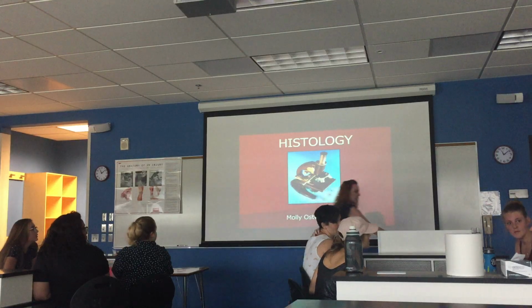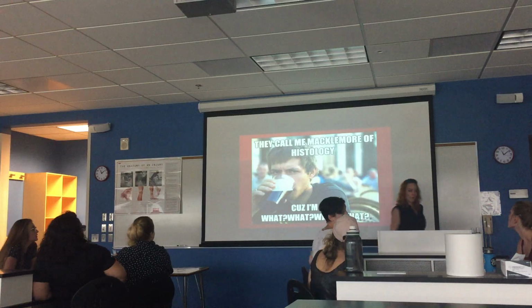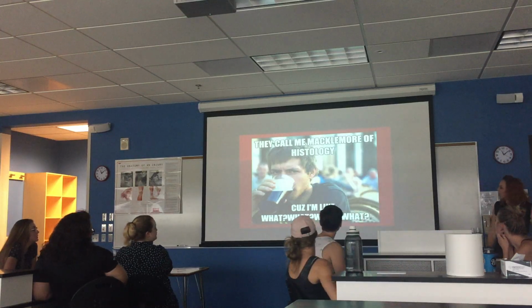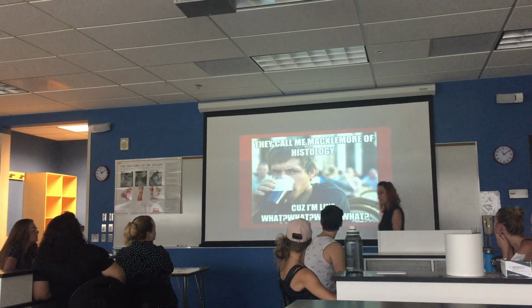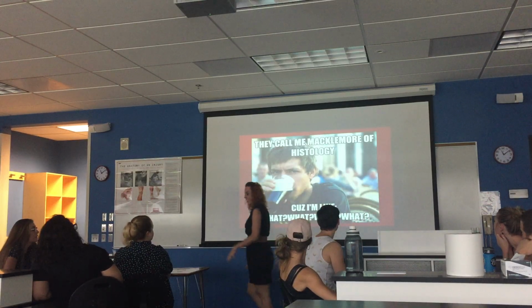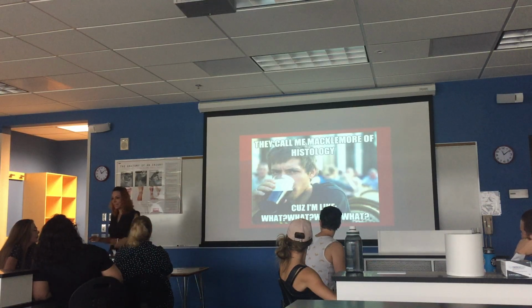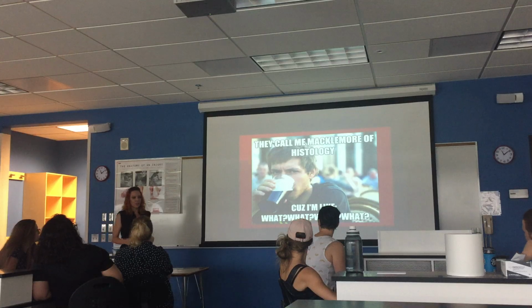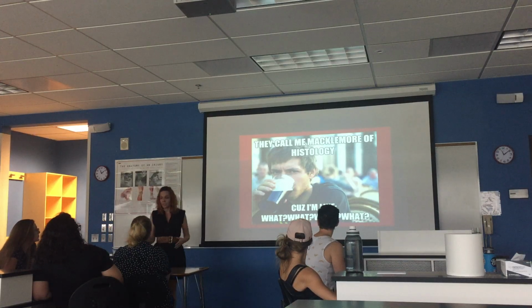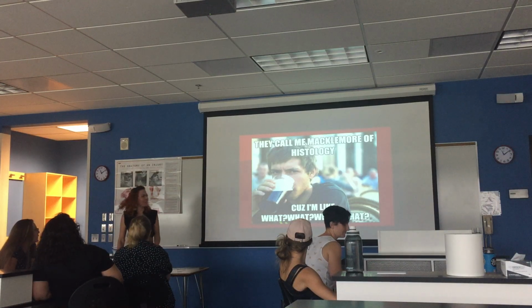All right. Well, my experience is that when students encounter histology for the first time, anatomy and physiology students, they're really frustrated by it. They're like, I don't know what I'm looking at. It's purple or it's pink, and I don't see anything. I don't know the top or the bottom. What do you want me to look at? And then usually you'll call me all over and be like, look what I found. And I'll be like, that's a hair. That's not what we're looking for.